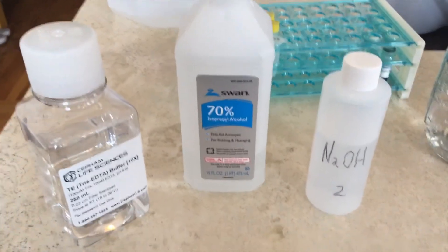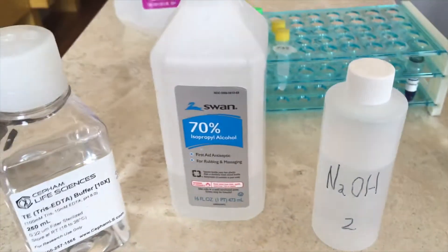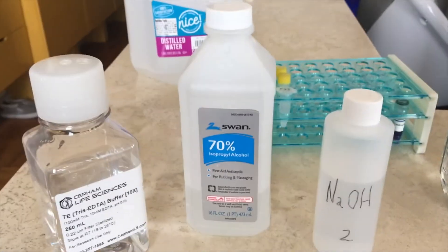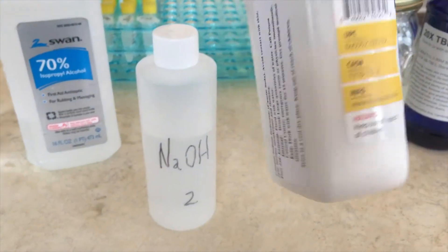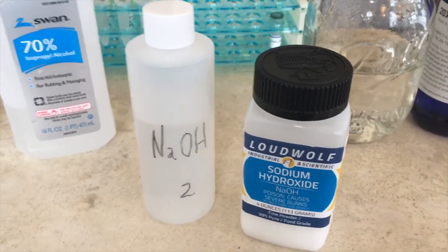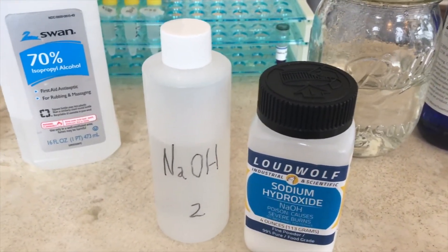Next thing is reagents — in other words, chemicals. You're going to need some distilled water, which you can just buy in the drugstore and it'll last you a very long time. You're also going to buy some isopropyl alcohol for cleaning your hands and equipment — once again from the drugstore and quite cheap. The next thing you're going to need is sodium hydroxide. I bought it as granules; it's not expensive and it's used in soap making. You can buy it on eBay or Amazon, and I turned it into a liquid — it's used to break down the fungal tissue. Try not to touch it; it's quite basic and can hurt your hands.